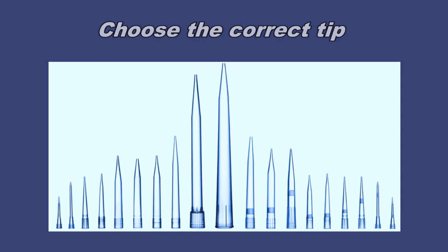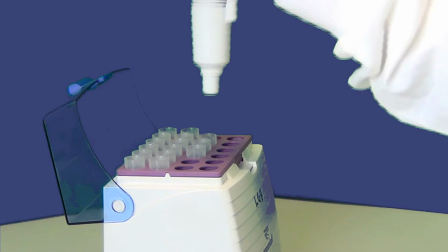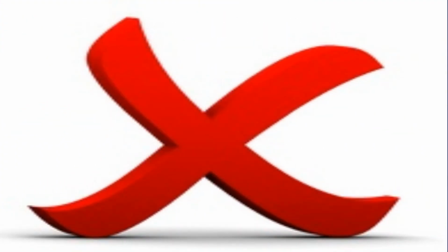Choose the correct tip for your pipette. It must be coupled perfectly to seal tightly. When coupling the tip to the pipette, do not use excess force as this can damage the seal.